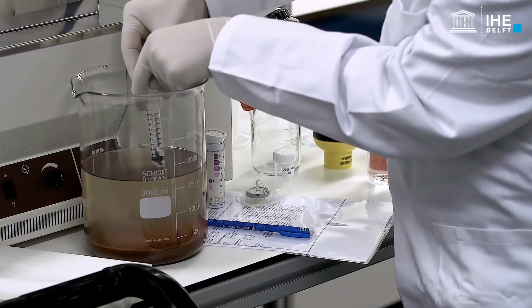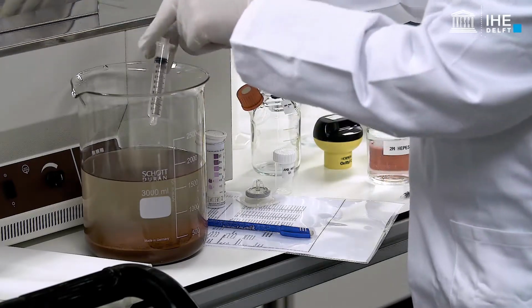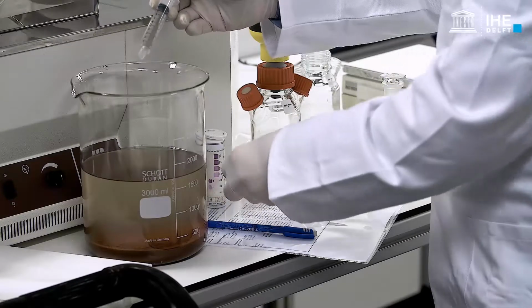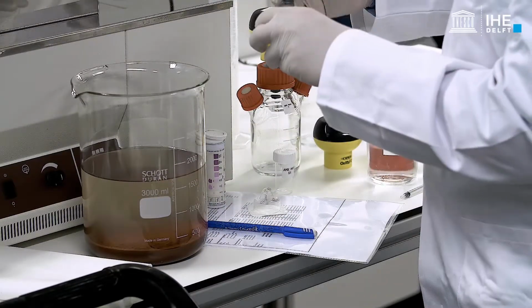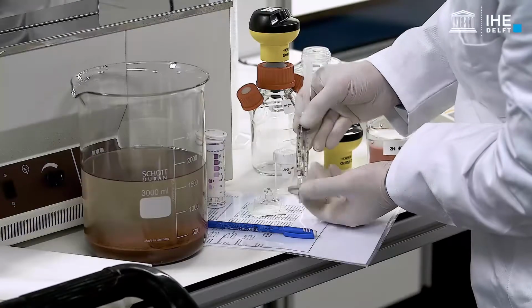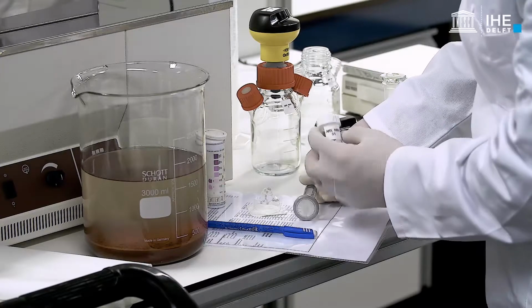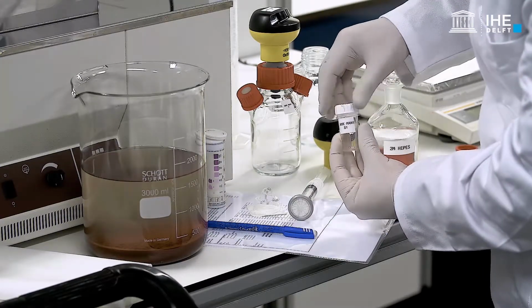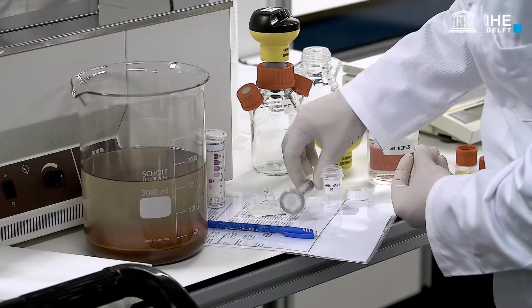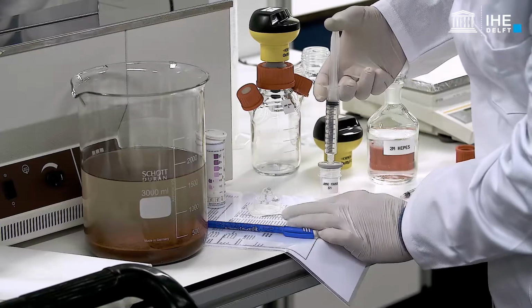Once the sludge sample is ready to be used in the test, take a filtered sample to determine the initial conditions in terms of ammonium, nitrite and nitrate concentrations. In particular, nitrate should be present as a redox buffer in order to avoid the occurrence of any sulfate reduction process and consequent sulfide production, which might result in inhibiting effects during the creation of anoxic conditions.